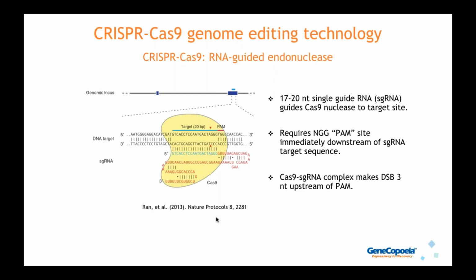And even to this day, the most widely used version of CRISPR, which is found in most bacteria and all archaea as an adaptive immune mechanism in those organisms, the most widely used version of CRISPR-Cas9 currently comes from Streptococcus pyogenes, or S. pyogenes, which is the same bacterium that causes strep throat. Okay, and this is a diagram that shows some of the basic features of the Strep pyogenes CRISPR-Cas9 system as it's used for gene editing.